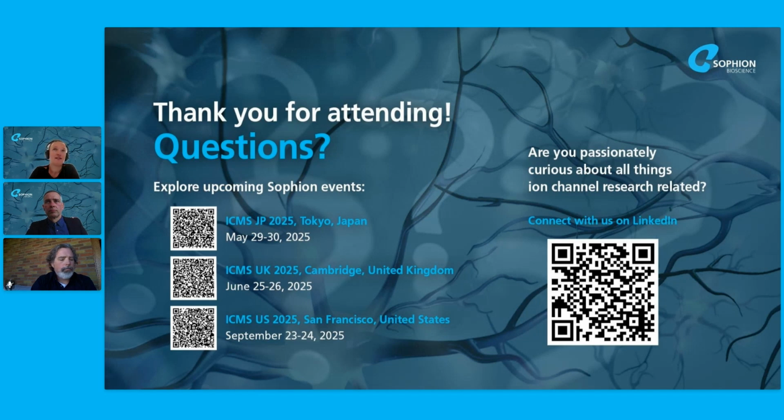And yes, we also tested compounds. So it was kind of a simplified version I showed. We tend to run experiments as you saw, voltage gated, then current clamp, and then the ligand gated, and then we would run voltage gated in the presence of compounds, or we would run current clamp in the presence of the ligand that we add, or something like that. Yeah, I hope that answered the question.